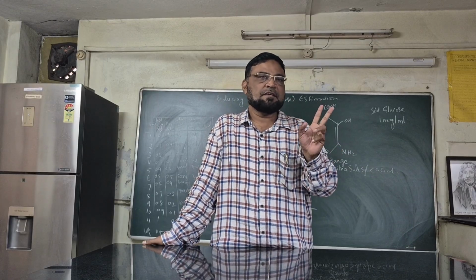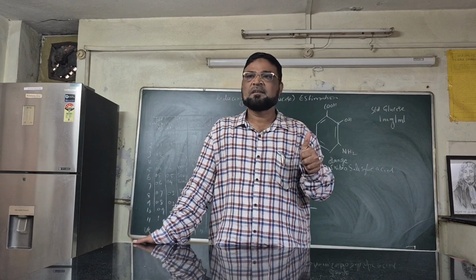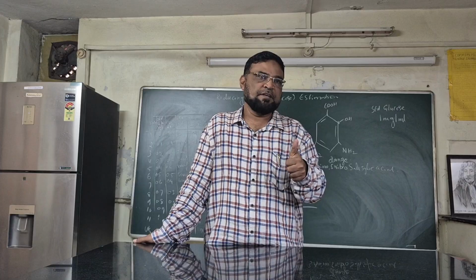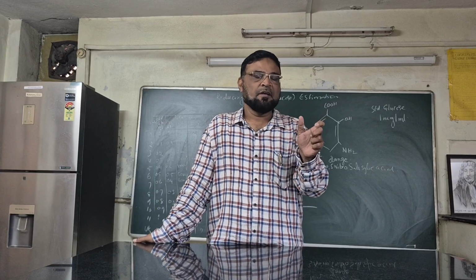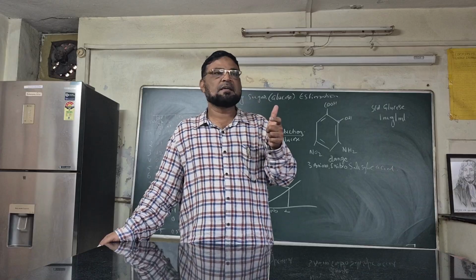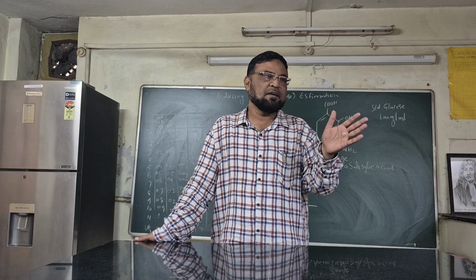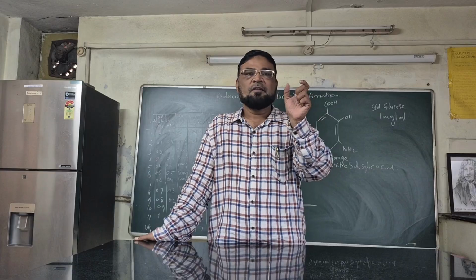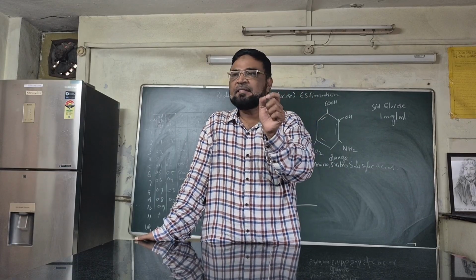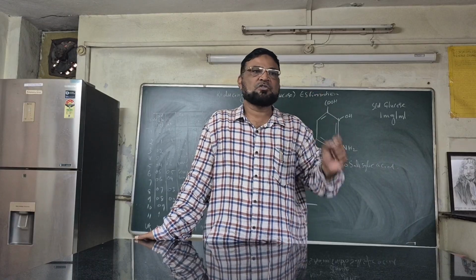Two things should be constant here. One, the wavelength of the light, the monochromatic beam that we are supposed to use. It will have a single wavelength, so we are using monochromatic light of constant wavelength. We are not altering it every time, so I am taking a fixed wavelength. Second, I am taking the fixed length of the cuvette, the path that the light passes through.